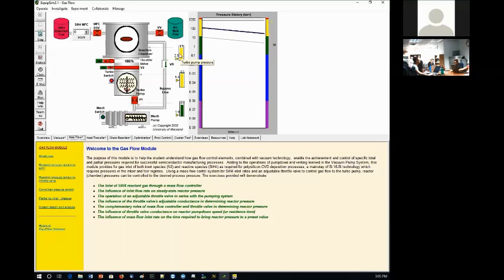Well, that's really a high crossover, by the way. Like a lot of the turbo pumps, they don't have a 1/4 torr crossover. They have more like 200 millitorr, 50 millitorr. That's the crossover that you would see on the tool. So I'm now in the torr range here in the reaction chamber. Yeah, I'm in the 10 to the minus range, so I can close this. I mean, I went below the crossover.